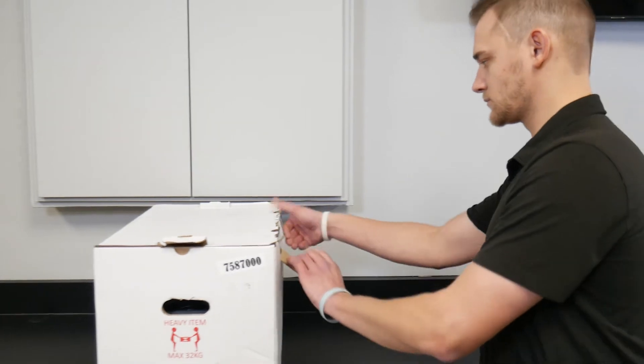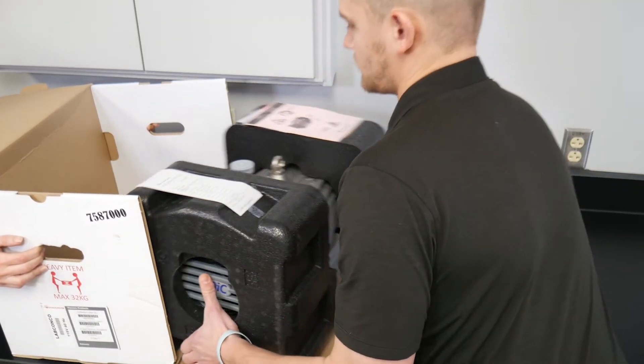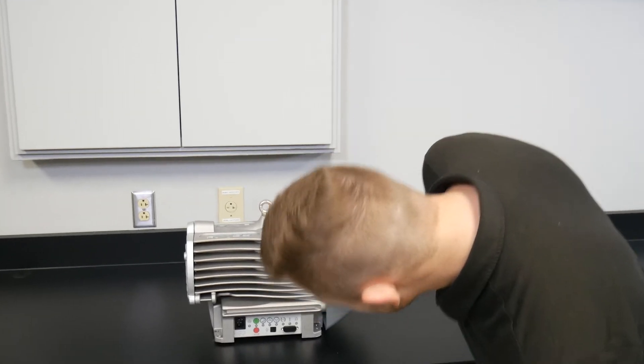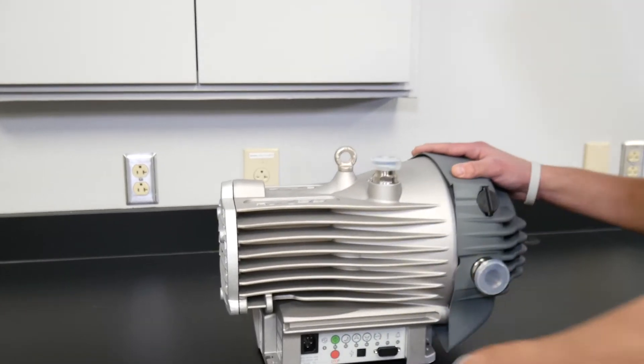Unpack and inspect your new vacuum pump as soon as it arrives. Notify the supplier and carrier immediately within 15 days if any damage is noticed, and do not use it.